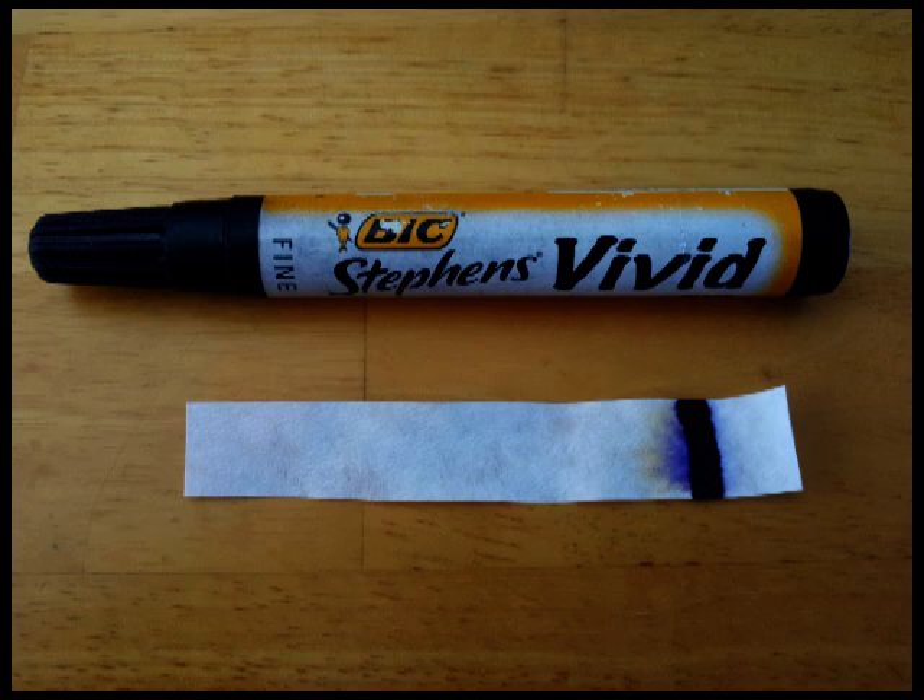You can also try a permanent marker. If you try a permanent marker you'll find that it barely moves at all, because essentially the ink is insoluble - it doesn't dissolve in water.